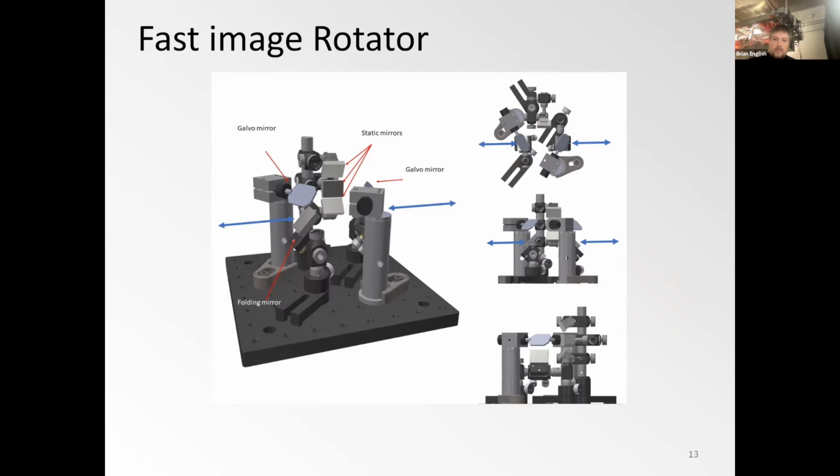What you are allowed to do is change that bias rotation. You could turn this whole assembly and put it lower and make these mirrors more flat. Imagine if they lay more in the horizontal plane, then they would become less limiting, because right now, for the central mirror at 45 degrees, the width gets reduced by the square root of 2. We didn't do that because we have no machine shop. To create an assembly where these would lay down in a bathtub would have been a bit hard, but it's conceivable.